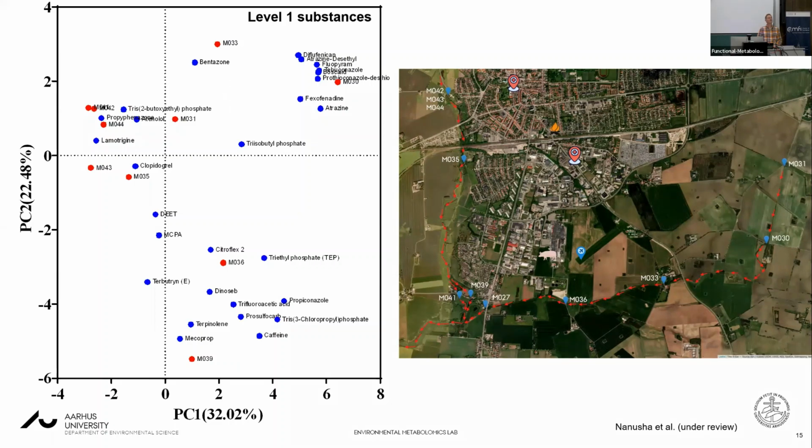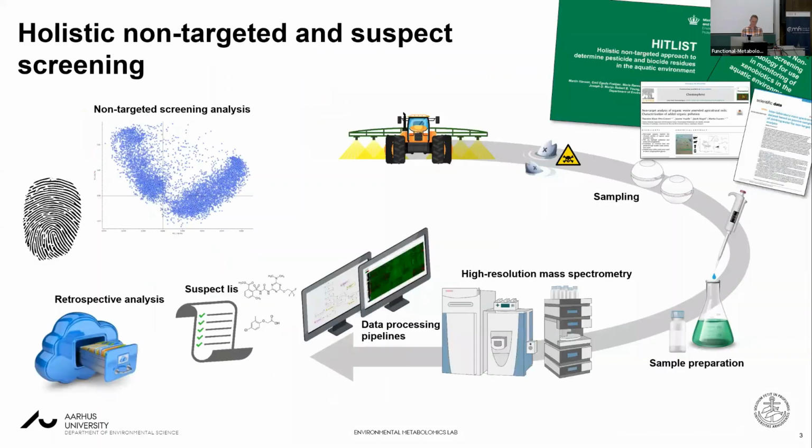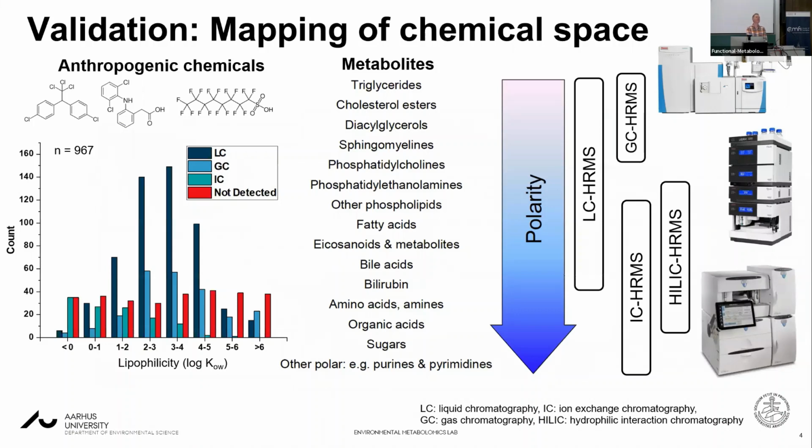You use different MS to cover the whole chemical space, but how about the sample treatment? Because for these different compounds, loss and recovery during pre-treatment can also vary. I assume you may use solid phase extraction to concentrate the sample. Yes, and even a different column can also lead to a different recovery of a range of different compounds.